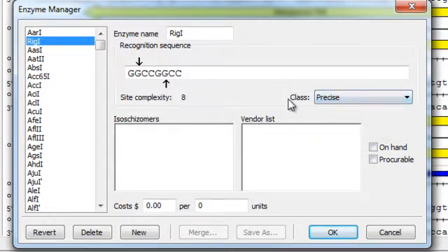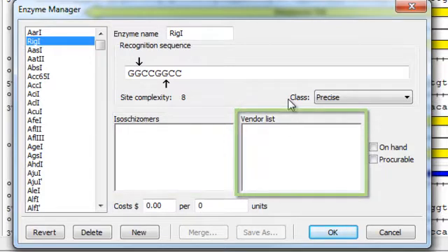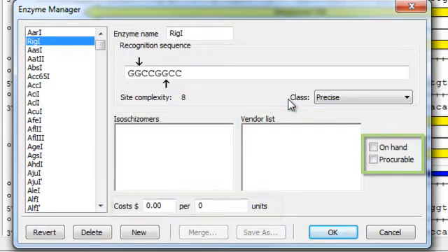You also have the option to specify isoschismers, vendors, cost, and whether the enzyme is on hand or procurable.